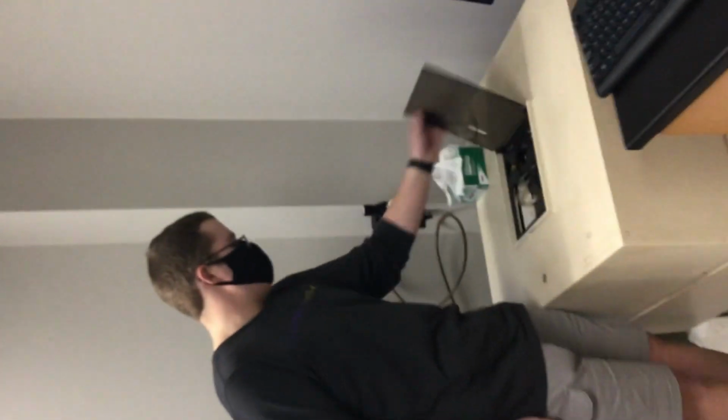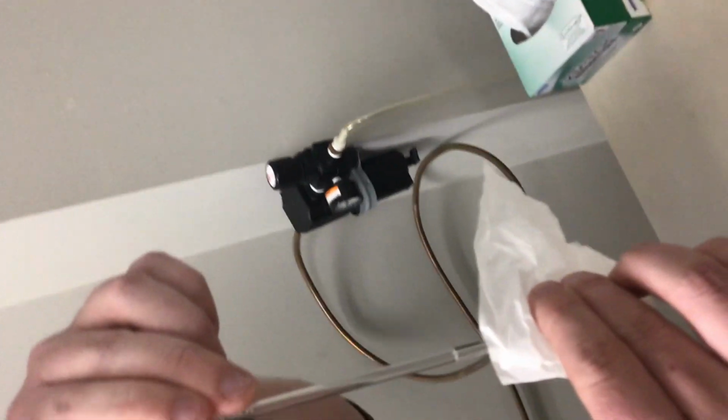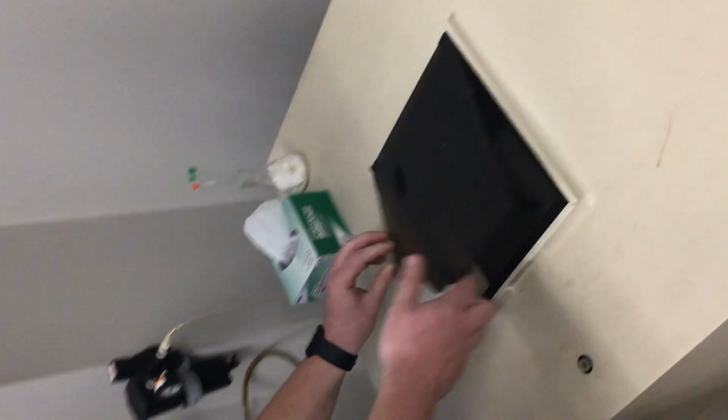When you're finished, come back over here, still spinning on the inside, turn it to 3 o'clock to turn the air off, and then up to the top, chem wipe, out. You can hold the silicate glass with your hand, that doesn't really matter, but I need to take the chem wipe to hold the other piece, and put whatever is supposed to go back in there, in this case the reference, back onto the spindle, get it to the right position, back down into the tube, and then close the top.